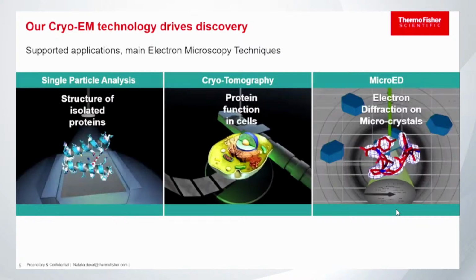So the resolutions you can get are the same as with crystallography. Again, it's very cool because for crystallographers like me, when I was working sometimes with membrane proteins, I was like, oh my gosh, this never crystallized, or I had very small crystals and it's very frustrating, and I cannot do anything with these crappy crystals. Don't worry. Don't put those crystals in the trash, because you can use them right now for micro-ED.